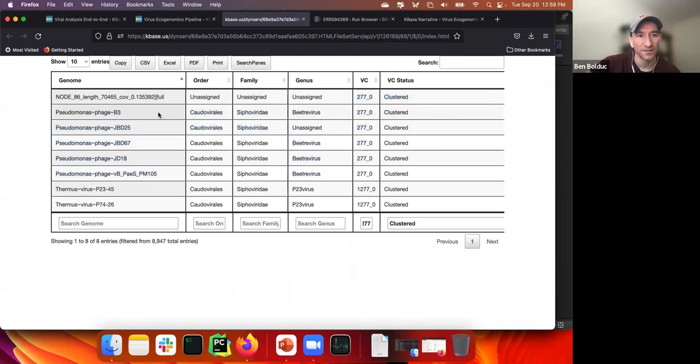But these 6 genomes, I basically assembled. This is almost definitely a Pseudomonas phage right here. And of course, it's going to be grouping with this particular genus. And so you've now identified, potentially, me, right here on KBase, have identified a totally new Pseudomonas phage. I would then take this genome and do some other sort of analysis with it in KBase. I'd be like, oh, let's align it to all of these Pseudomonas phages that we can pull in data from NCBI or JGI or whatever.